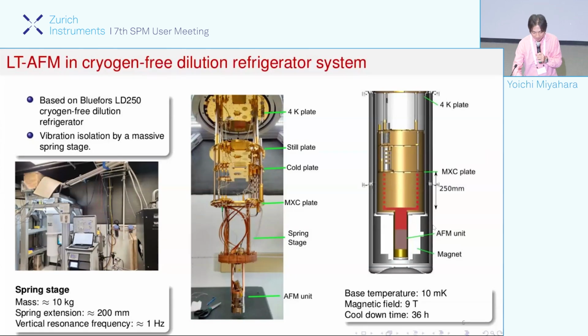So my strategy was to get a very big fridge like this, which is typically used for superconducting quantum computers. It's really big, with lots of volume inside. To cope with the mechanical vibration, because it's very noisy, we devised this spring mass damper system.